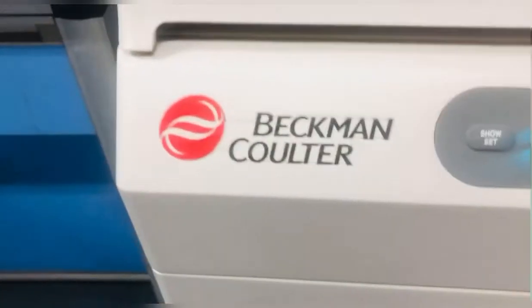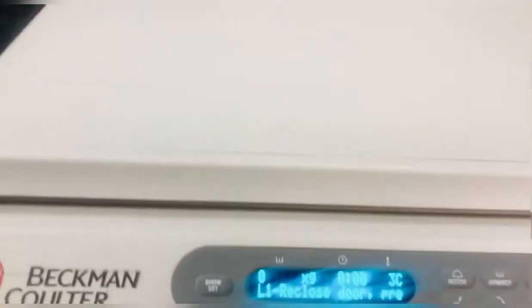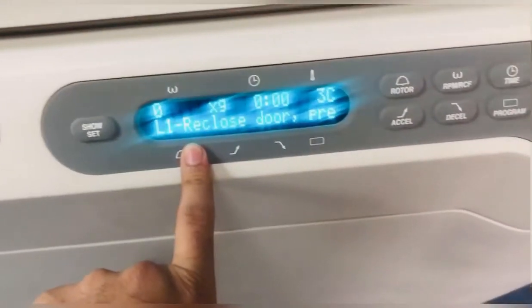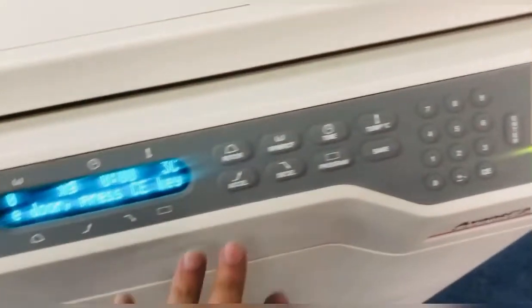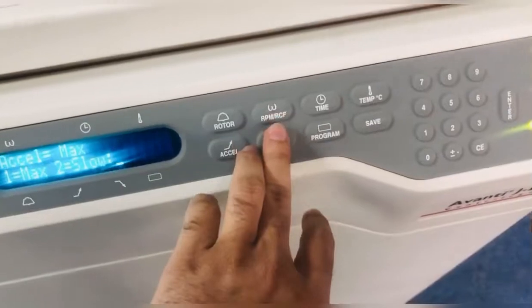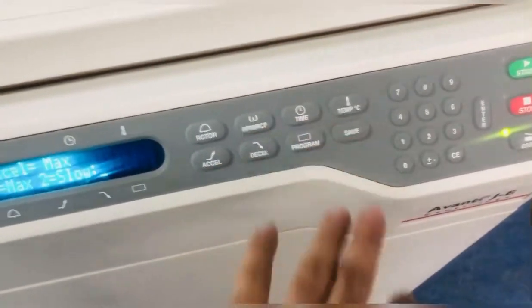This is a huge machine and there are a lot of samples you can use at the same time. There is a screen with a digital pad which is used to set your temperature, revolutions per minute, and time, whatever you want.